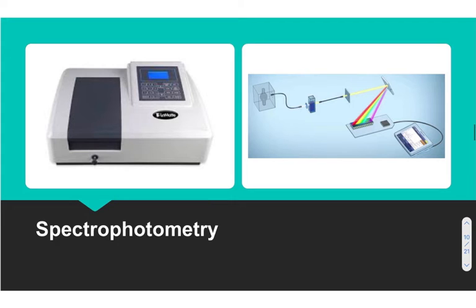So absorption is how much light did we lose? How much light was there in the beginning that we did not get back at the end? And absorption is actually directly proportional to concentration. That is, we can make a graph that says if we have absorption, this is equal to some constant times the concentration. And often this is expressed as the extinction coefficient times the concentration. And sometimes you'll see the path length, but the path length, or L, in these scenarios is often designed to be 1 centimeter so that we don't have to take it into account. So you'll often just have absorbance is equal to some coefficient times the concentration.